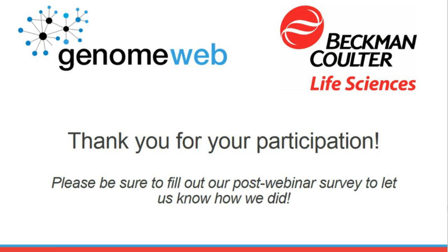Great, thank you, Davoud. Sohaila, I have a couple of questions for you. Could you tell us what the maximum volume is that the Echo can dispense?